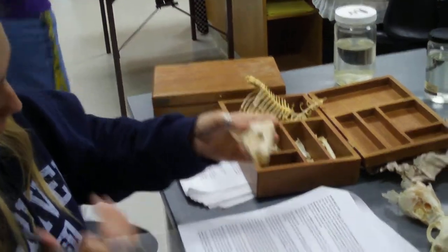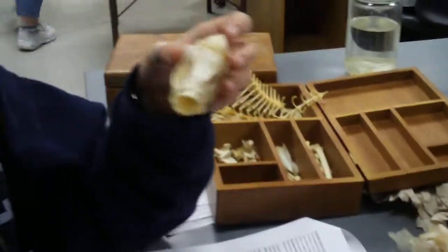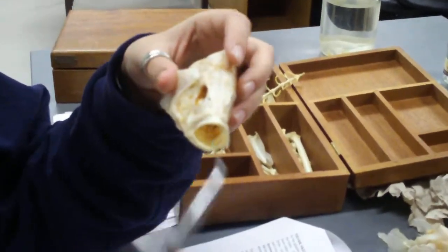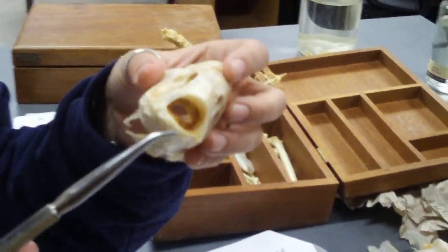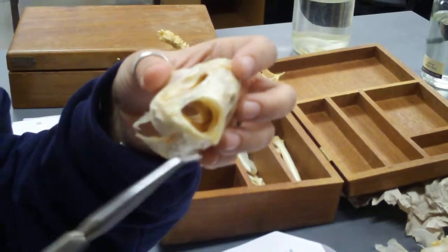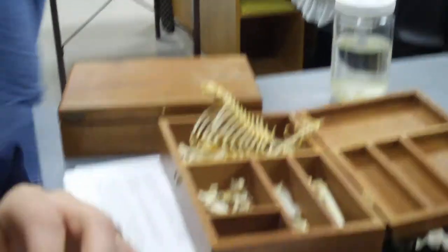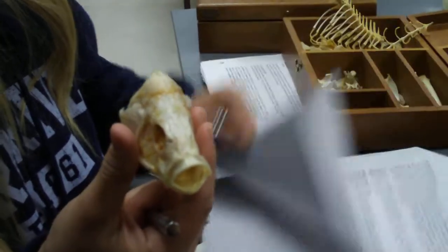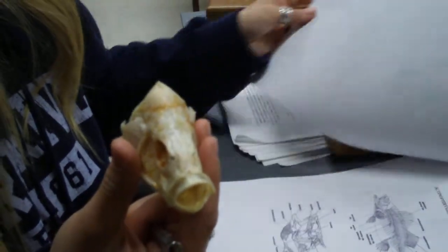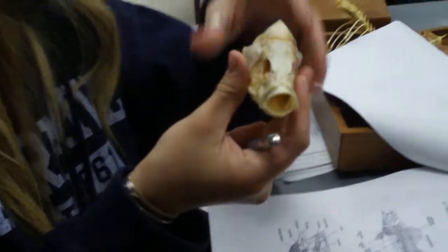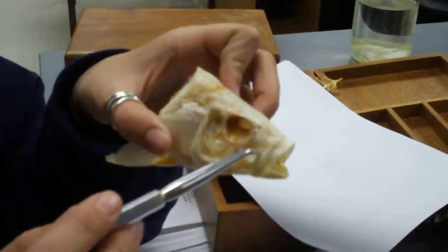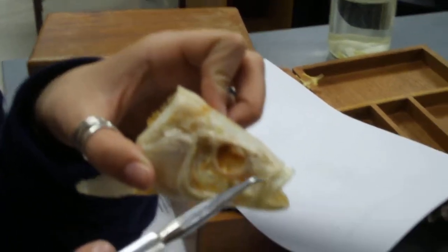Okay. Pre maxilla, dentaries down here. So dentaries, this whole part. Pre maxilla. Maxilla is this kind of triangular thing on the side. Can you guys all see that? Maxilla.